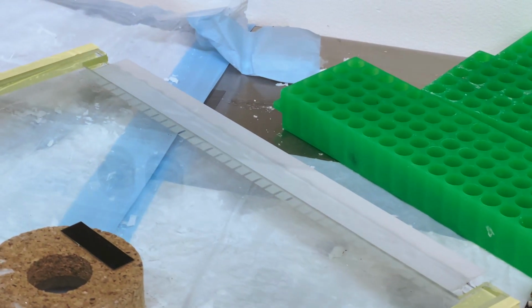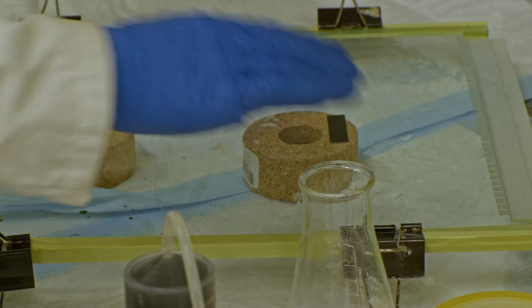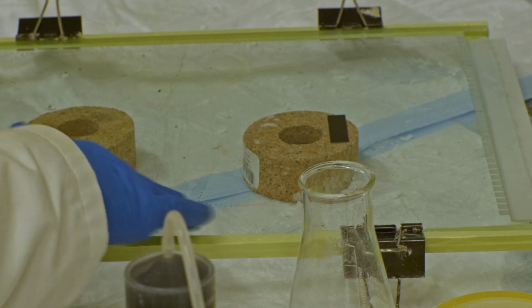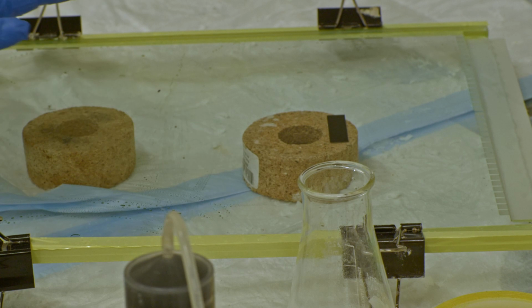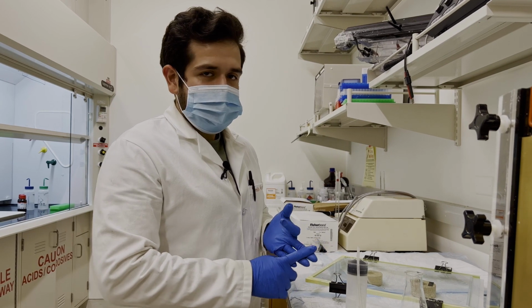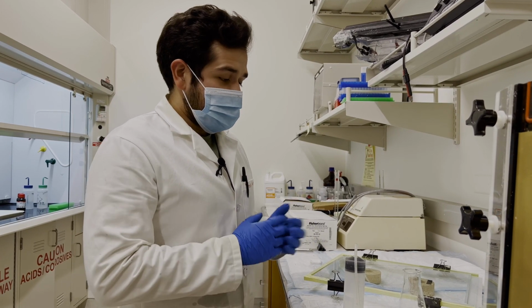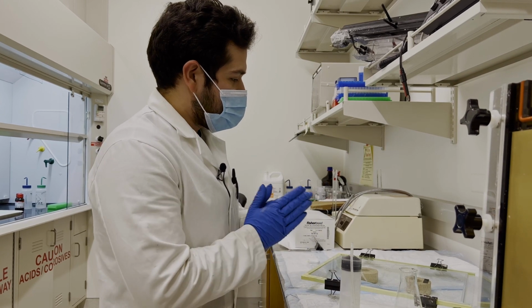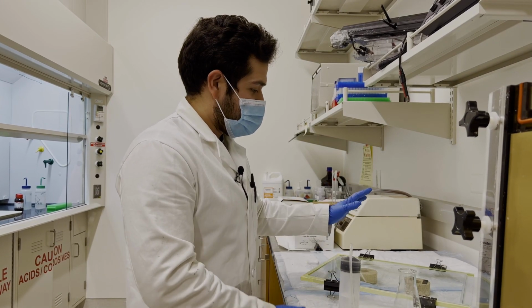Now that the gel is properly set, you can do other things while this is setting. Of course, you can get your samples ready to go for the actual primer extension studies, which means that you have to gather your materials: radiolabeled DNA, the polymerase of interest, which in our lab is polymerase eta, a translesion synthesis DNA polymerase, as well as a mixture of the dNTPs at 50 micromolar of each. So we'll gather those materials together, ready for the experiment that will occur using this gel.